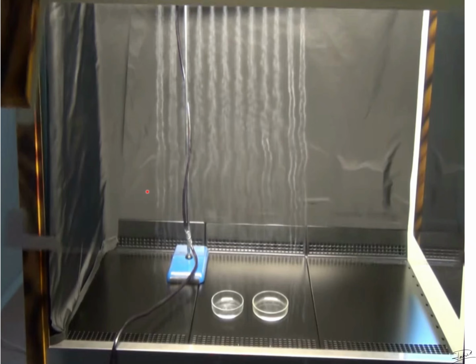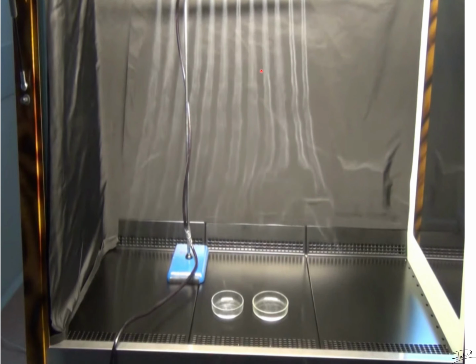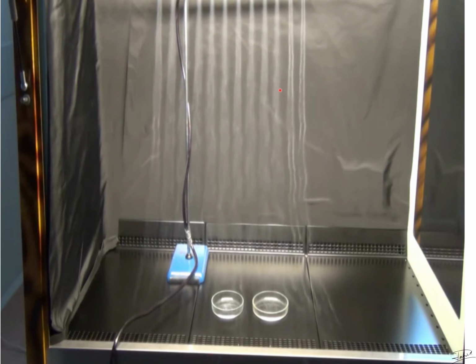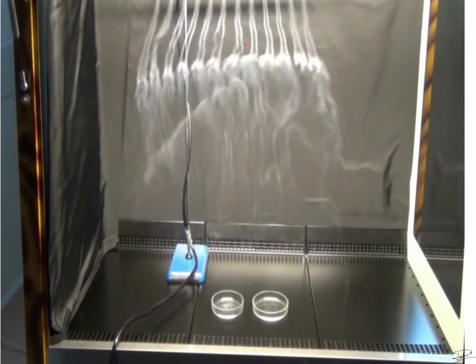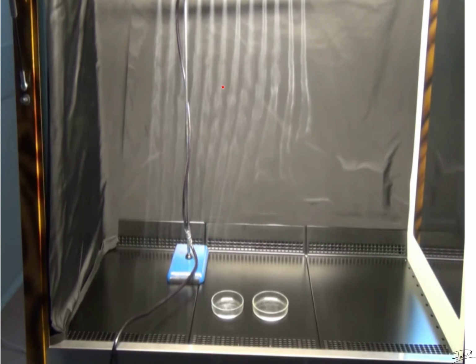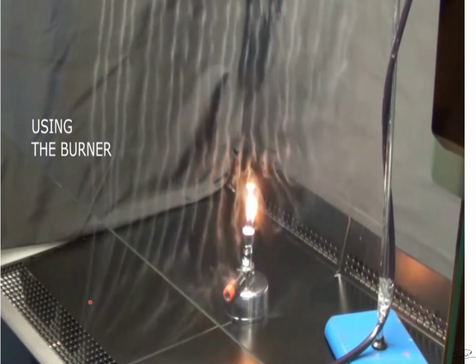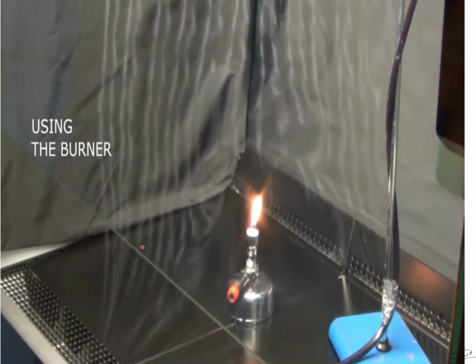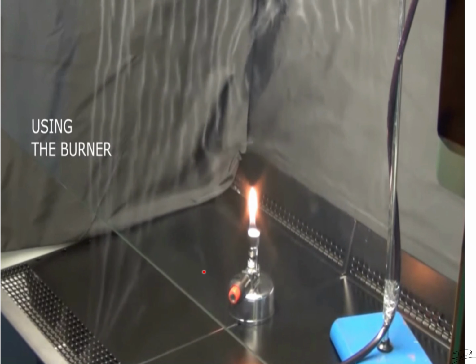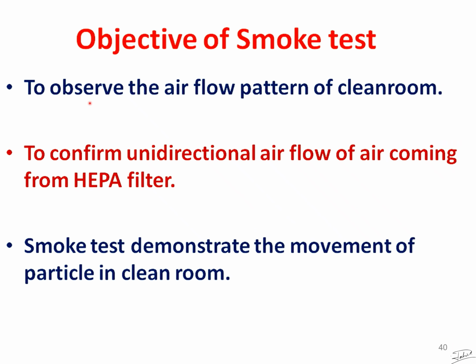So let's see how the smoke test is done. We can see smoke has been used in the duct line, and this is the unidirectional airflow of the HEPA filter. The air is flowing very efficiently and getting out by the drainage. Okay, we can see the pattern of unidirectional airflow here. That is, the HEPA filter is working properly.